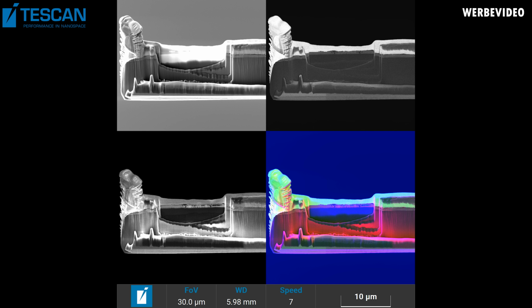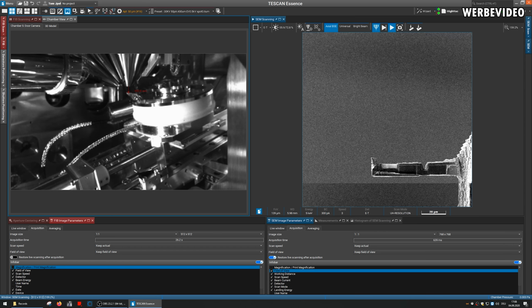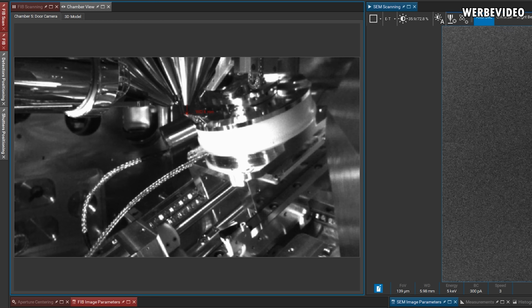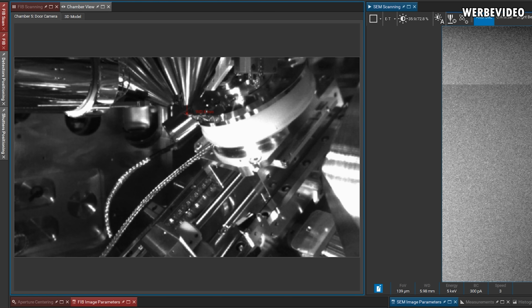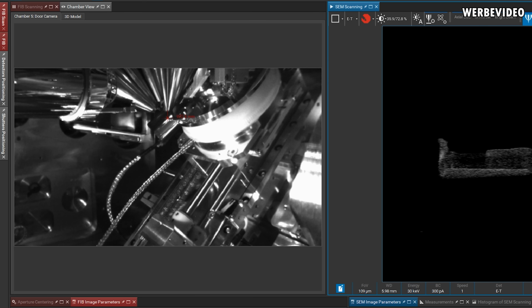And you can now see in this image how rugged the surface of this lamella is. It's quite impressive already, just seeing those images from my perspective. And if you're paying very close attention, you can see a gray, very thin layer within the lamella, and that is actually where our transistors are located. Finally, we can use the STEM, and as I said before, that is used to run electrons through the lamella, and we are now able to see AMD or TSMC 7nm FinFET transistors.